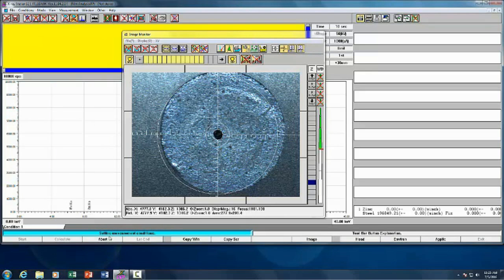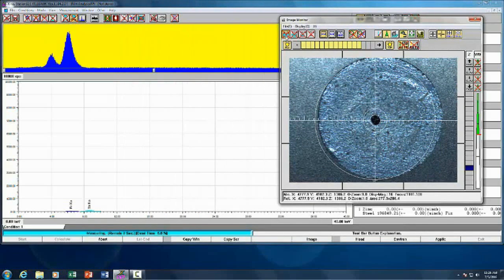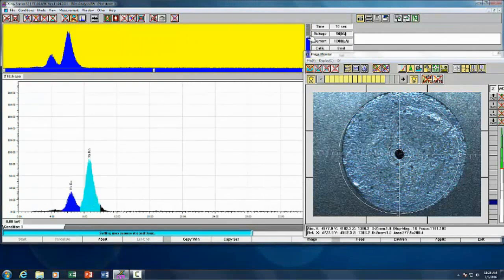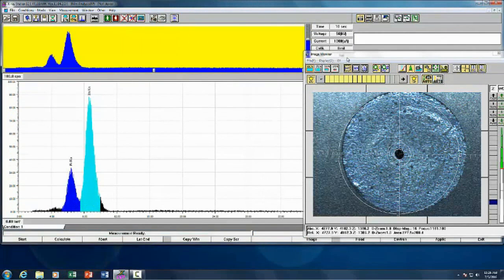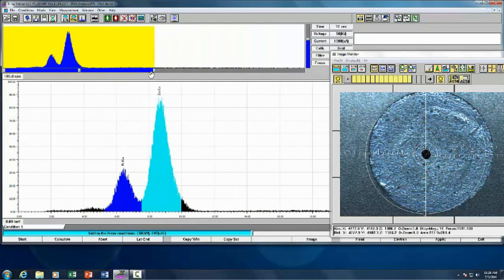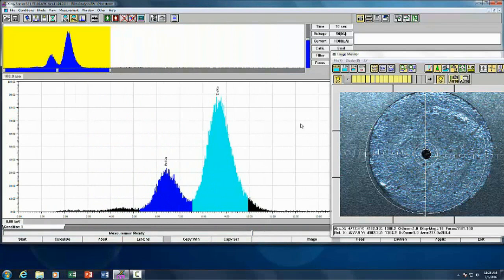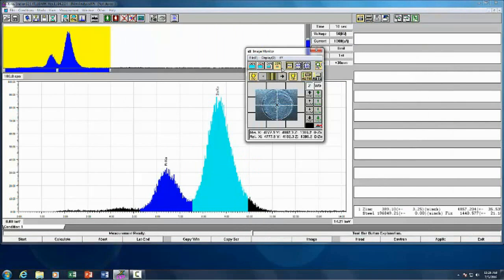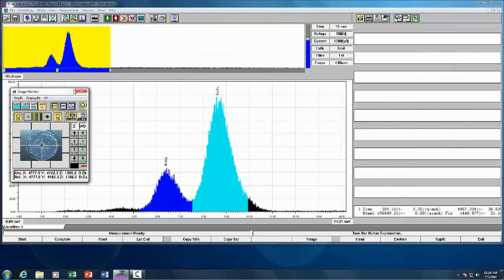We'll wait 10 seconds. Down here in the lower left is your status bar. Shows you the measurement time and the dead time. We can move the camera image over here and increase the spectrum so you can see the different elements and position it even further for your zinc and your iron. If your camera window is too big for you, you can make it 25% and put it over here, for example. And you'll see down in the lower right hand corner is our thickness at 389.1 microinches.